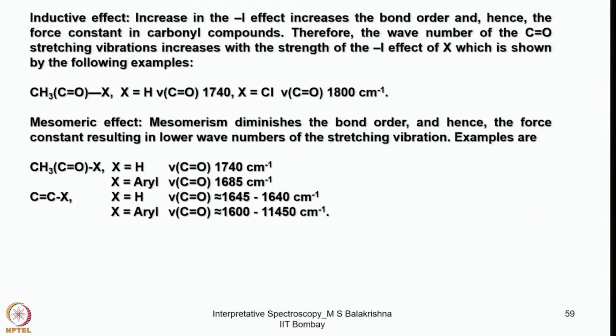A few facts we should remember while analyzing. One important factor is the inductive effect. Increasing the inductive effect increases the bond order and hence the force constant in carbonyl compounds. Therefore, the wave number of the C double bond O stretching vibration increases with the strength of the inductive effect of X, which is shown by the following examples. When X equals H, 1740; when X equals Cl, it becomes 1800. It is considerably shifted, by about 60 centimeter minus 1.